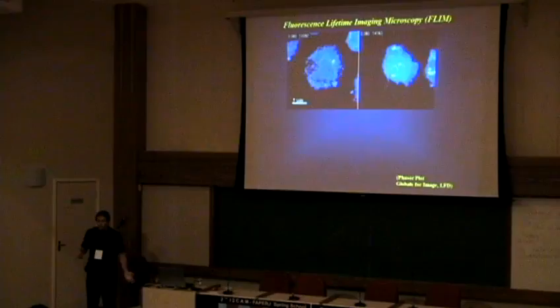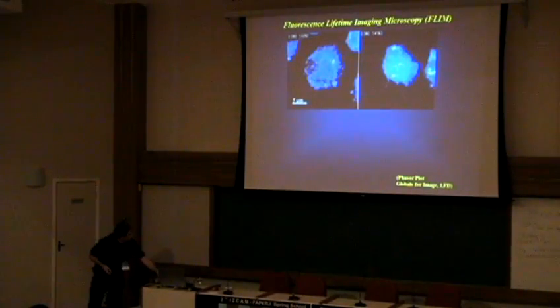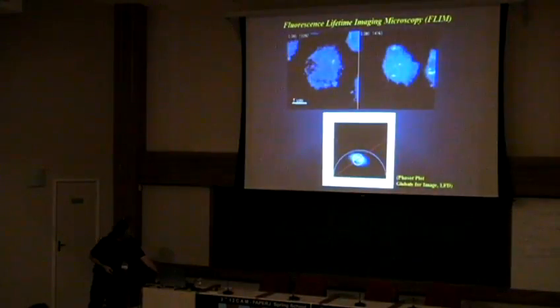We measure the lifetime inside the live cell doing fluorescence lifetime imaging microscopy. And what we could see, well, this is the phasor approach. I'll not talk a lot about this, but this is an approach that was developed in the LFD when we were there. Instead of doing many fittings to calculate lifetime from images taken at different frequencies of modulation of the light source, which is very difficult, the lifetime data is converted to a graphic. And this shows all the pixels in the image, and the place where they are here are related to the lifetime, to modulation and phase lifetime.